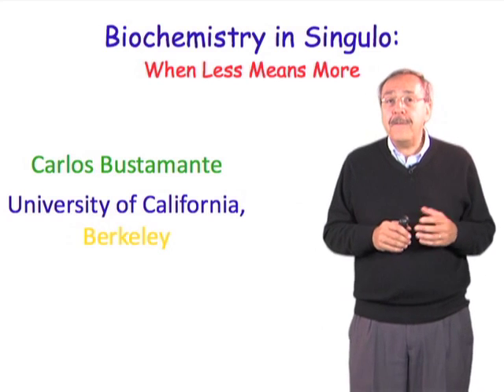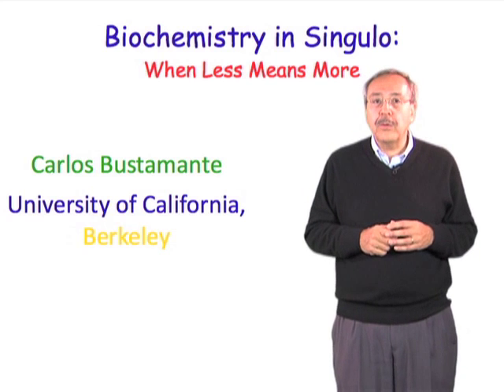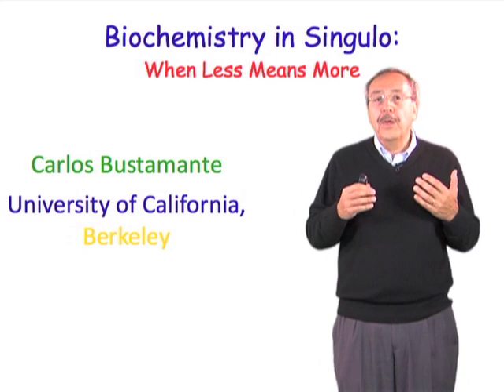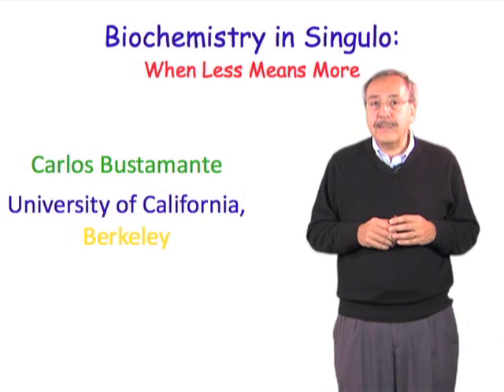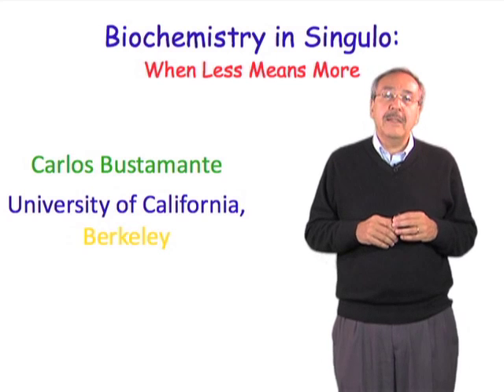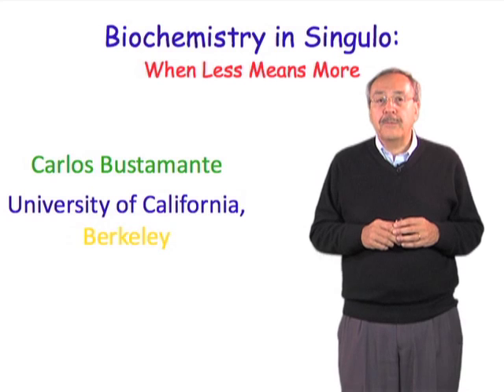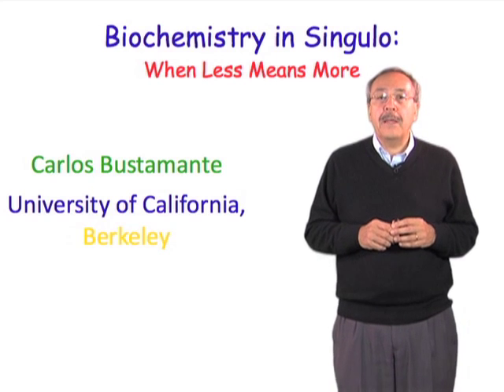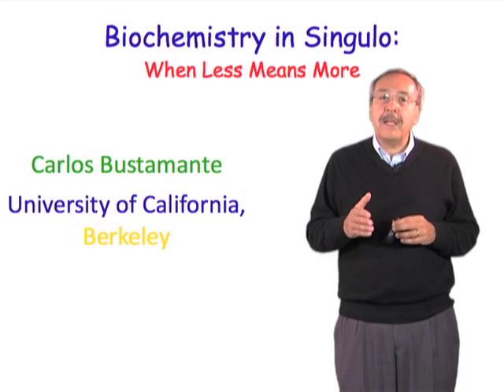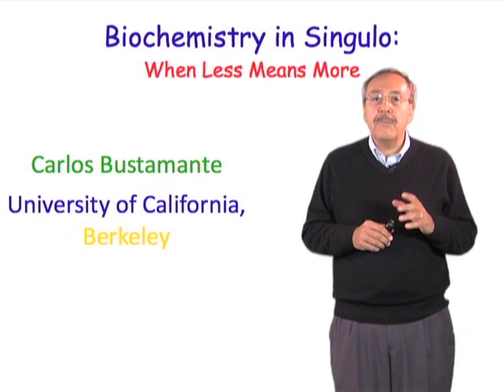In the first half, we are going to talk about why we want to use single molecules, some of the rationale of why we study these reactions at the single molecule level, and what instrumentation is used to do that kind of experiment. And in the second half, I'm going to present a particular application of these methods of single molecule manipulation to study a molecular motor.